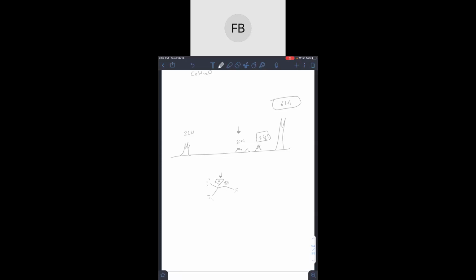Or sorry, 3 hydrogens on that side in order to be a quartet, right? Yeah. So there's these 2 hydrogens right here. Let me erase everything else. So these 2 hydrogens right here are now a quartet because they have one hydrogen to the left and 2 hydrogens to the right.